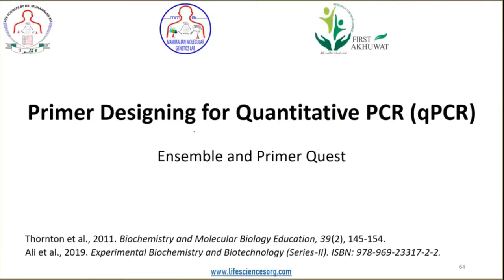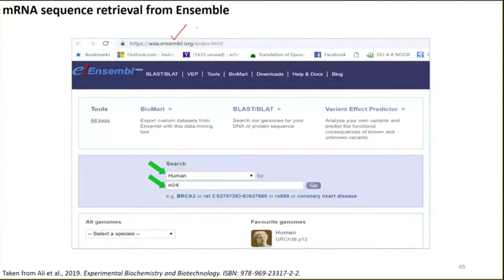Next, we are going to design the primers for the quantitative PCR. In the previous endpoint PCR, we obtained the DNA sequence from the NCBI, but this time we are going to use another database called Ensembl. This is a very useful database containing the DNA sequence, gene sequence, mRNA, transcript, and protein sequence for human, for mouse, and for several other species.